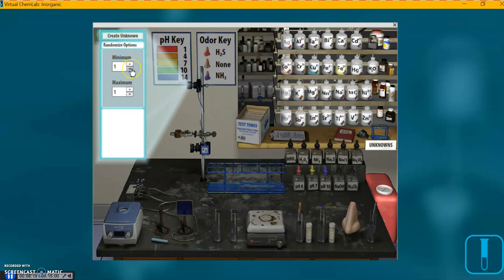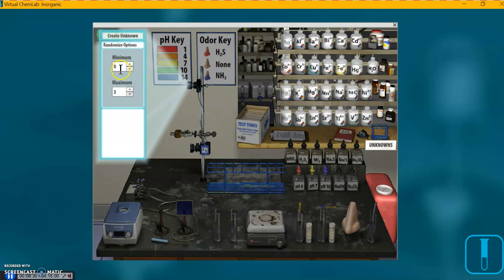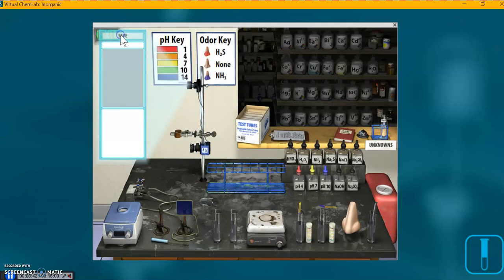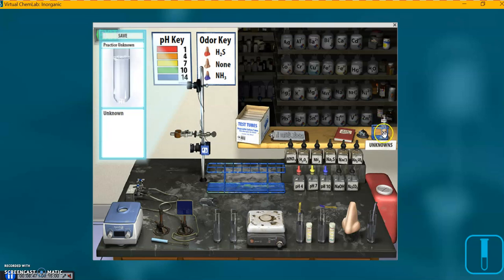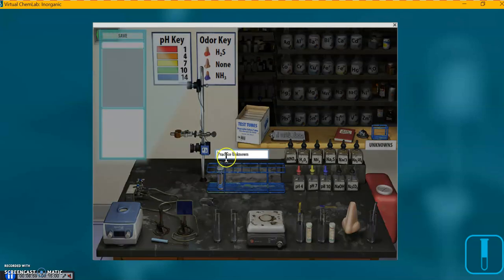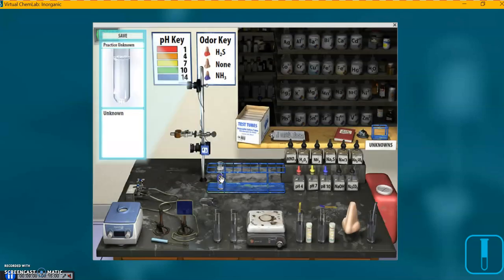And on step 7 there on your worksheet, it says to make the minimum 0, the maximum 3. That means your practice unknown can have 0, none of your ions. In other words, it's just water. It could have a maximum of all 3 of them, or just 2 or 1. And up here, a little hard to find, it says create unknown. And right over here, you see, it just appeared there magically. We have a practice unknown.